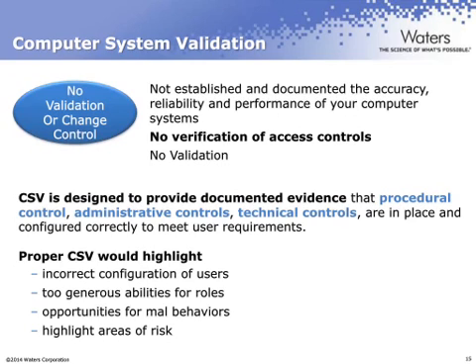One aspect of this really is around that delete privilege. It should be that everybody in the laboratory who is responsible for producing results should not be allowed to delete data, and that's very easily controlled in almost every piece of software by privileges. However, I would advise that it's really useful to be able to document evidence that a particular user, or a particular number of users, when they try to delete data, it would not be possible.